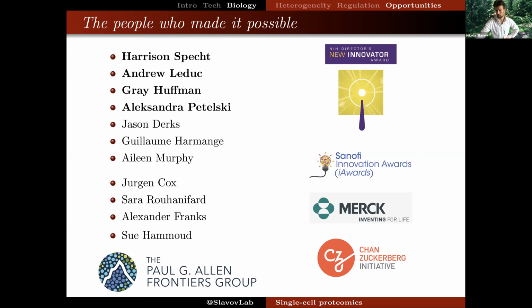What we have measured so far has been very much prioritized based on protein abundance, in the sense that we instruct the instrument, when you see more ions than you have time to analyze, how are you going to choose? We tell the instrument, use a heuristic: pick the most abundant first, the second most abundant second, the third most abundant third, and so on. We don't have to do that, but we've done it because in the absence of other information, that's a convenient heuristic. And that's one of the reasons our measurements are swayed in favor of more abundant proteins.